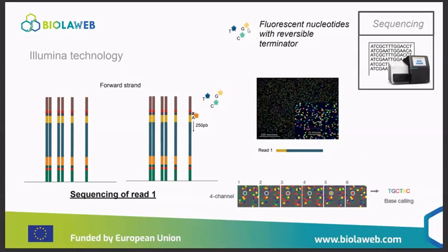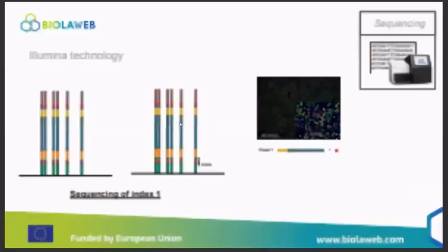Yes, it's kind of deoxynucleotides, but they have this fluorescence capacity. And then, because you have a cluster, when it flashes, you will have this flash of red, and you know that red is an A. Thank you.